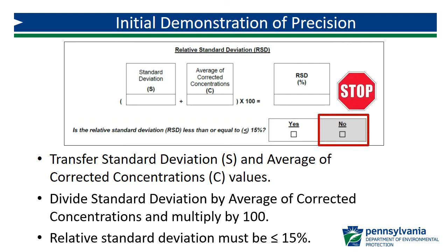If the relative standard deviation is greater than 15%, the analyst's procedure should be evaluated so the source of error can be determined and addressed. Once any issues have been identified and corrected, the analyst should repeat the IDC procedure. If the analyst is not able to successfully complete the IDC, he or she should not conduct compliance measurements for chlorine residual.